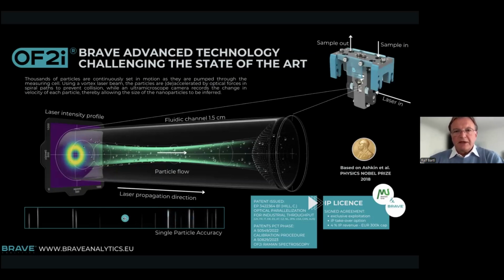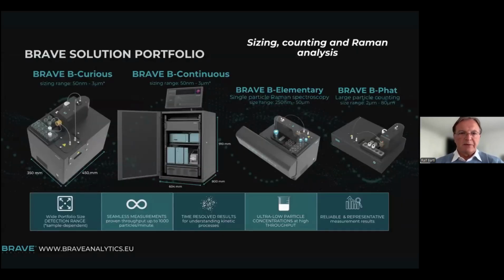It moves through the camera picture, and the intensity as well as the speed is used to further analyze the particle properties, like size, for example.